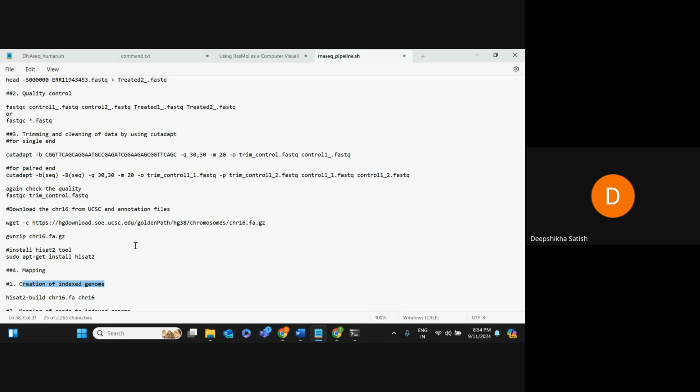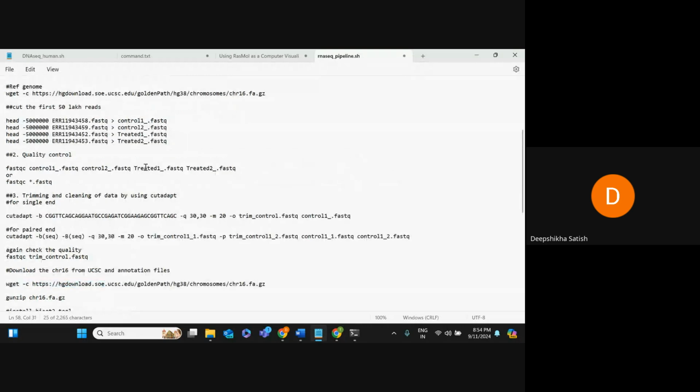But you will have an idea how to perform this. Once you are able to run this one application, you can perform any other application also, because it's just about knowing how to run the commands. The first important thing is to install the tool. If you are able to install the tools, then you can open the manual, where there are commands.